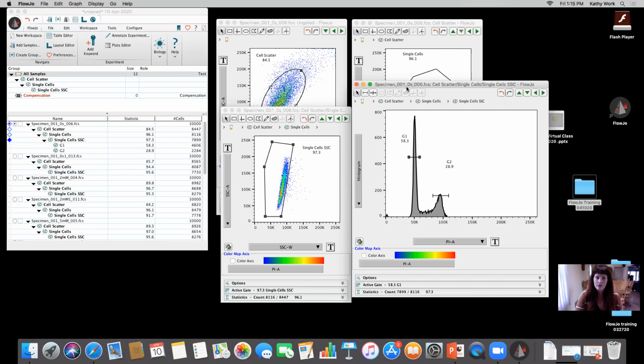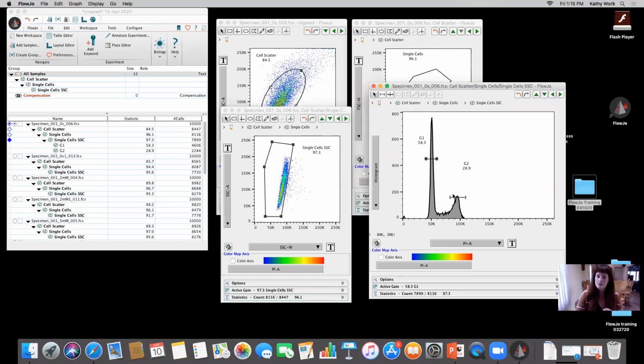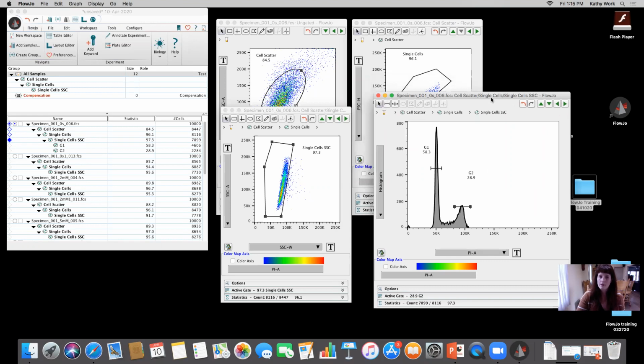So I just wanted to bring that up and show you something that some people might be trying to do that probably wouldn't be the best practice when trying to analyze cell cycle data, because we're limited in our capabilities as humans to be able to pull out that univariate data.